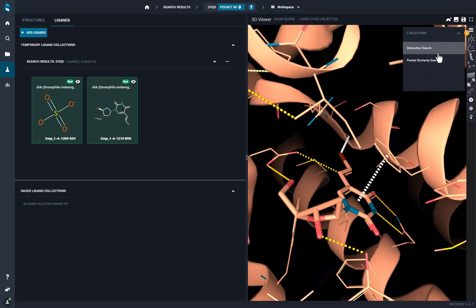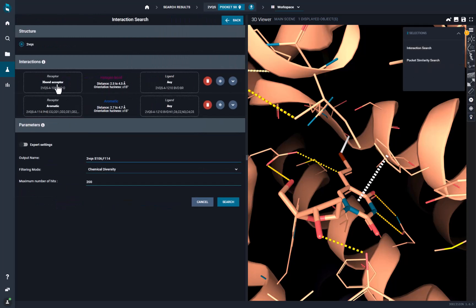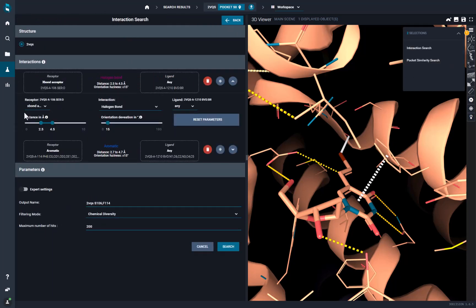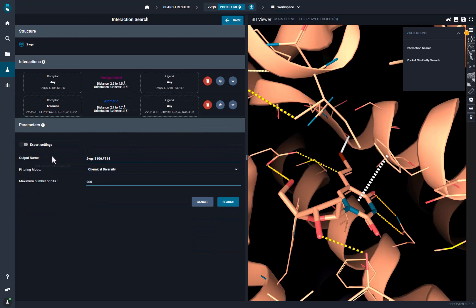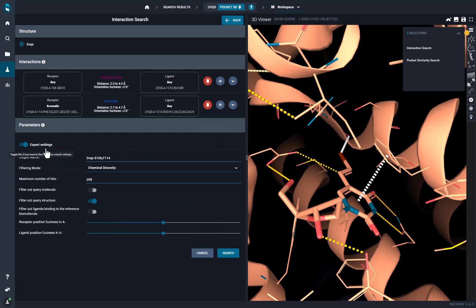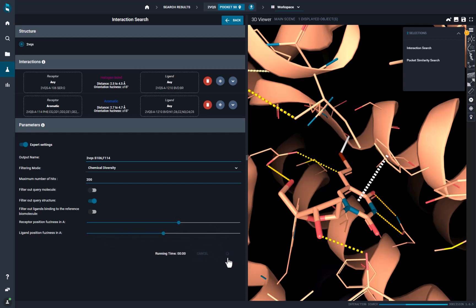Now we can start our interaction search. In the menu, we have the list of the query interactions. For each interaction, we can customize the interaction type and the interactants, to make the search more or less permissive to the query. We also have some global parameters. We will increase the geometry tolerance of our search, with higher permissivity in the position of the protein residues involved in the interaction.